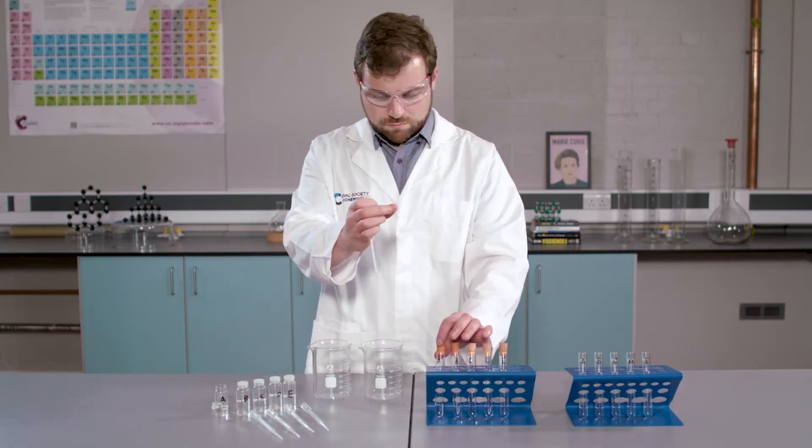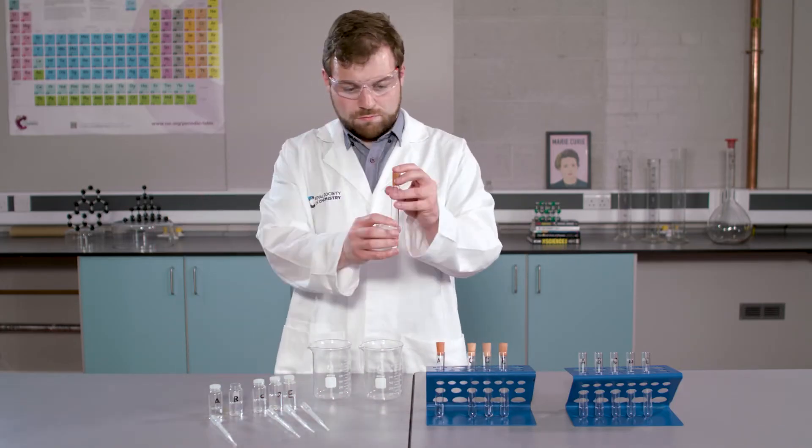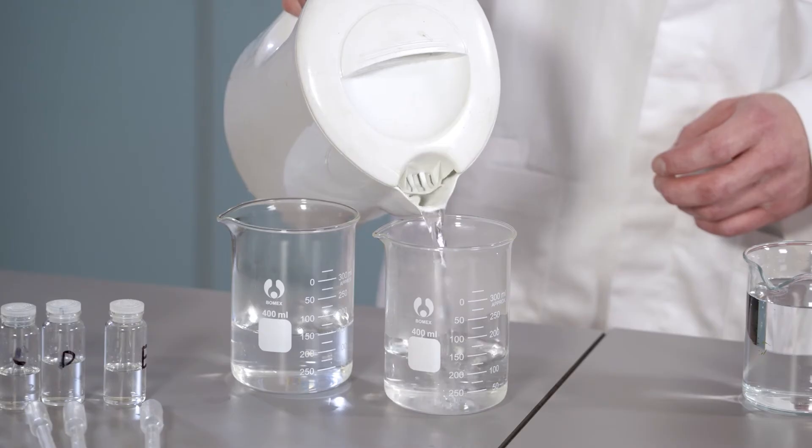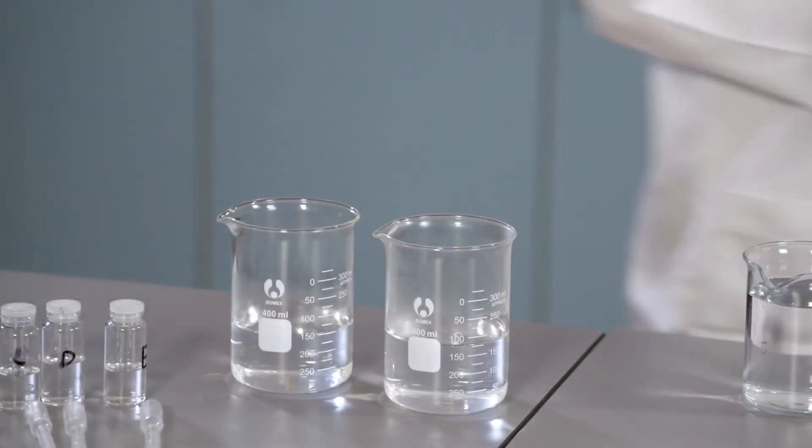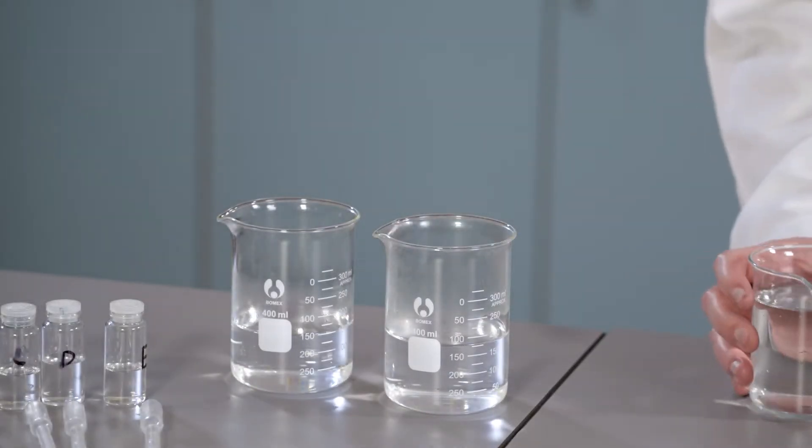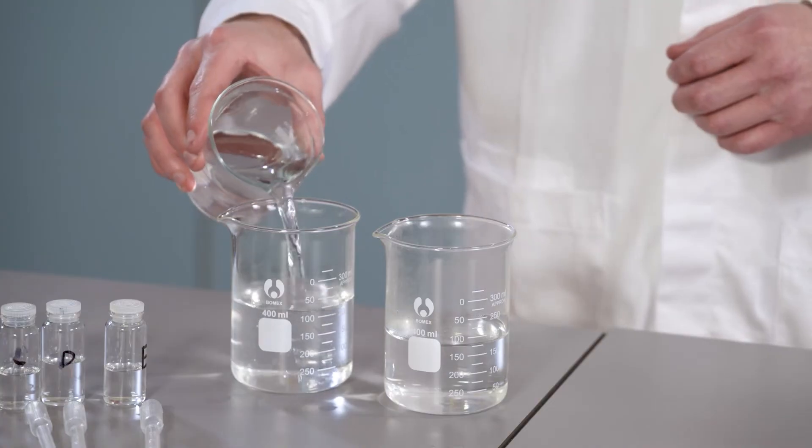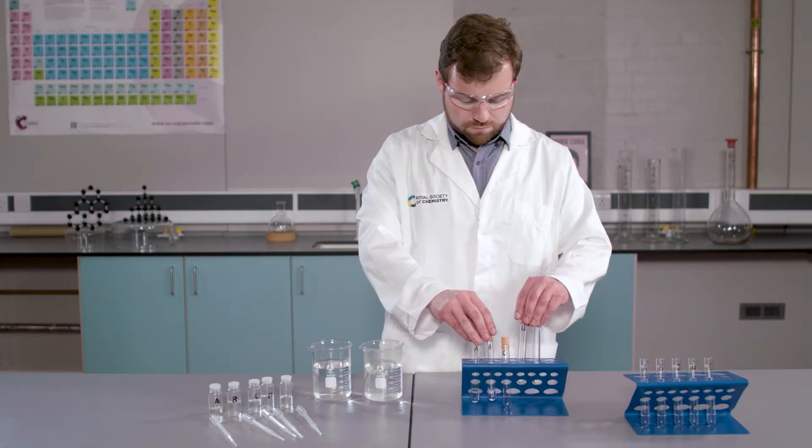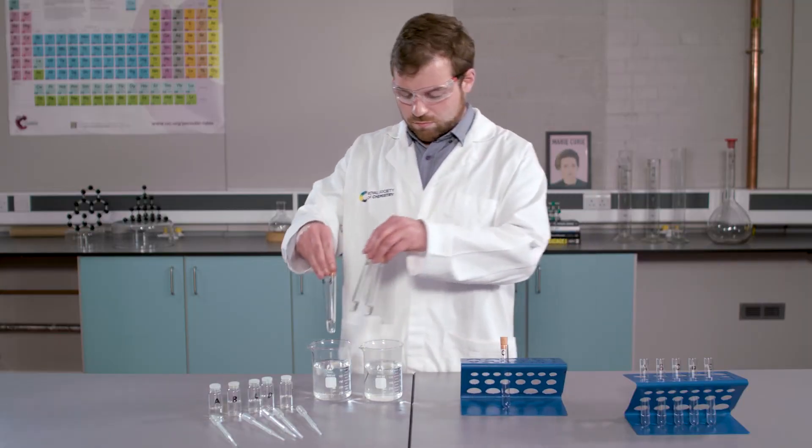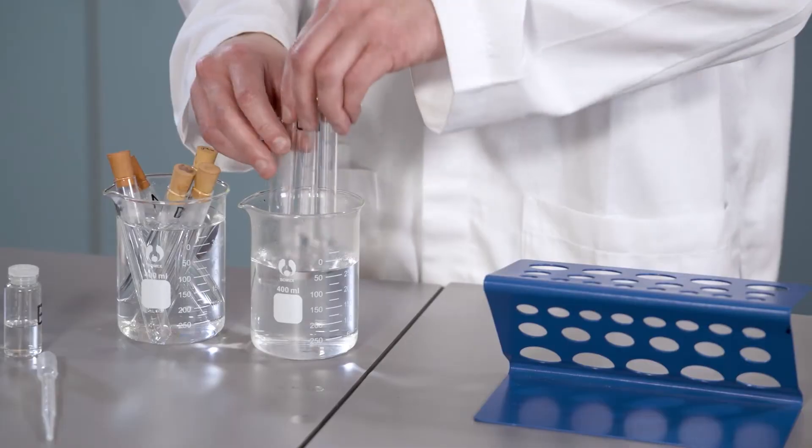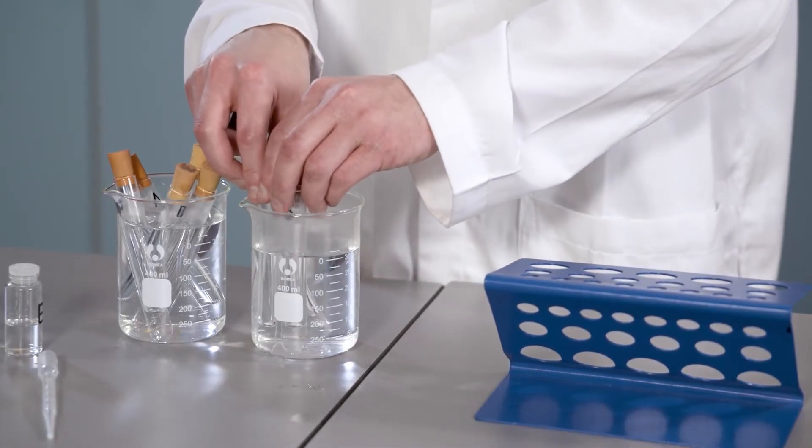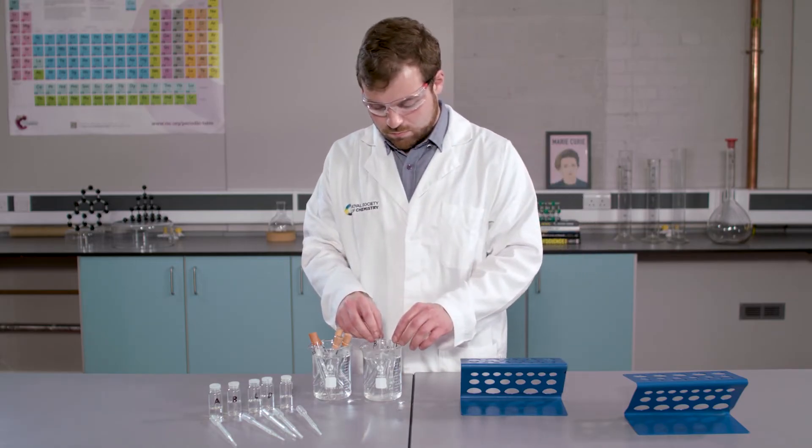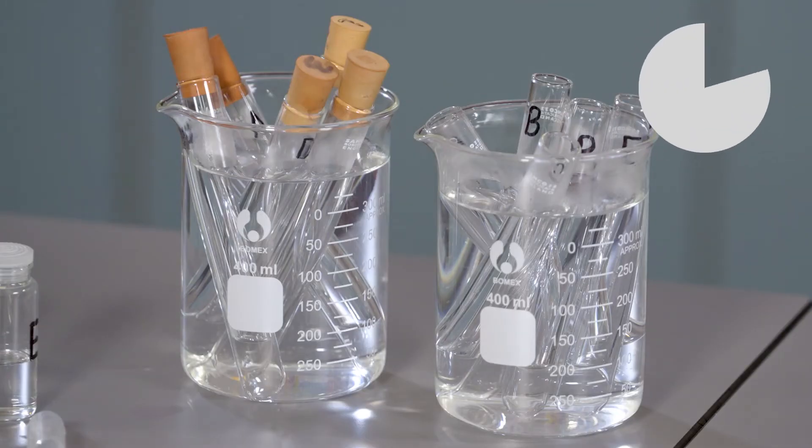In the first step, I am going to add ten drops of each of our samples to two centimetres cubed of ethanol. As always, I have labelled our test tubes. Next, I am going to make two water baths, with half of the water coming from a freshly boiled kettle and the other half from a cold tap. I am now going to place our test tubes containing samples A to E into one of the water baths. Into the other water bath, I am going to place five test tubes containing 2.5 centimetres cubed of silver nitrate solution. I am going to leave this for around five minutes.